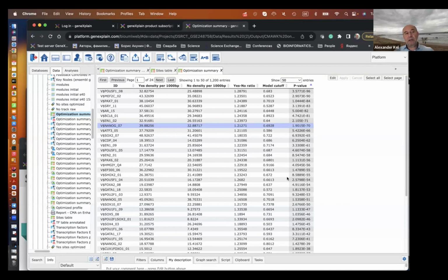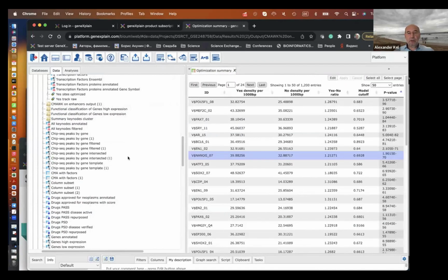So these tumor cells are very special. They are reprogrammed to be very much pluripotent. So they are so-called maybe tumor stem cells. Some people call them like that. And they're very difficult to kill. Still, when you analyze it with such a tool, you can find a set of targets which can be targeted already by existing drugs, but it also shows some new possibilities for other drugs, which you see also in that report. All right, so that's something I wanted to tell you today.